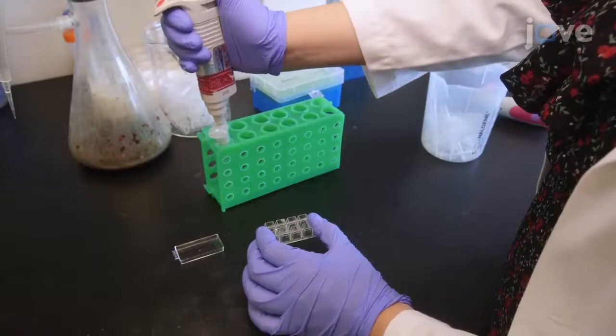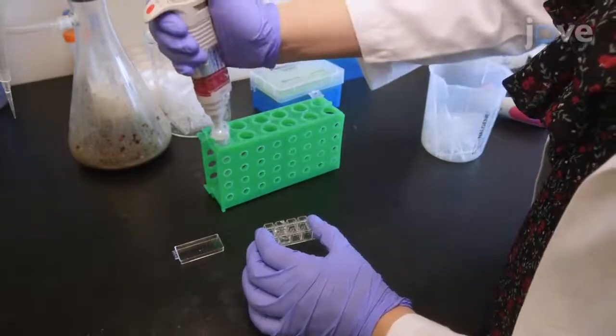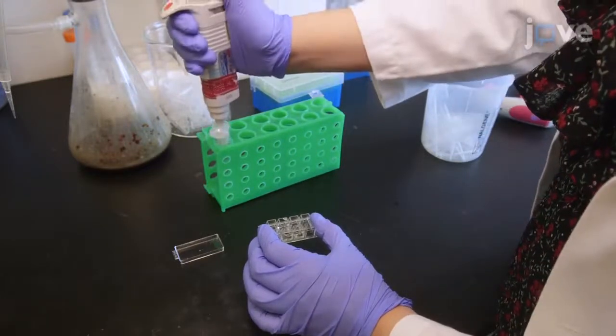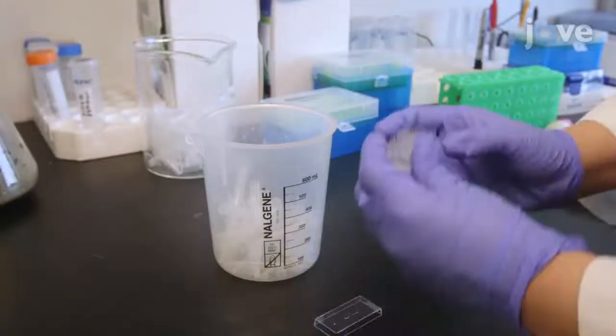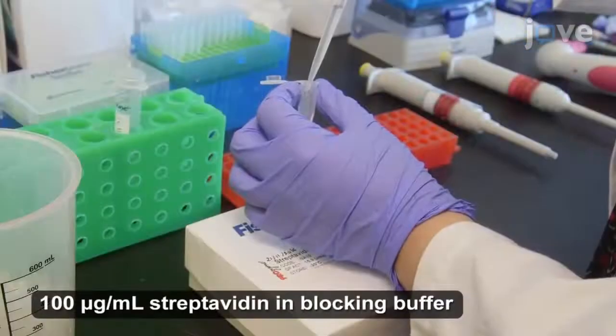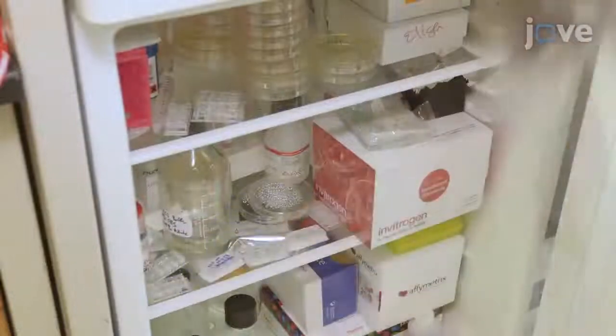Block bio-PLL-coated surfaces with blocking buffer consisting of HEPES buffered saline with 2% BSA for 30 minutes at room temperature. Following the incubation, remove the blocking buffer from the bio-PLL-coated surfaces without allowing the wells to dry. Then add streptavidin and incubate at 4 degrees Celsius.